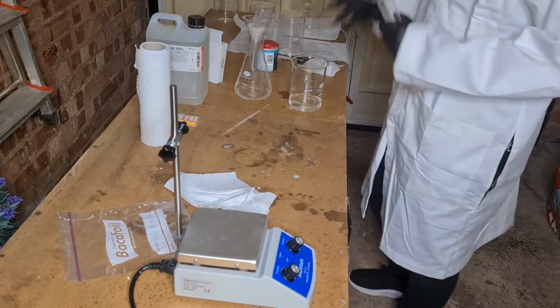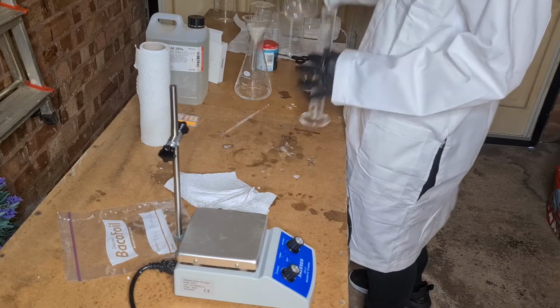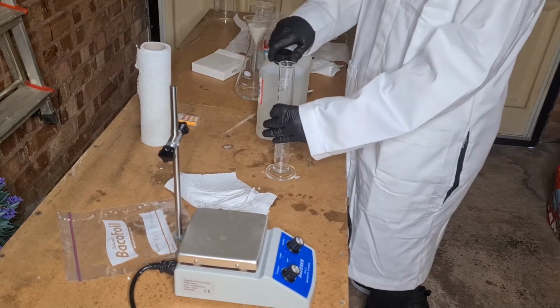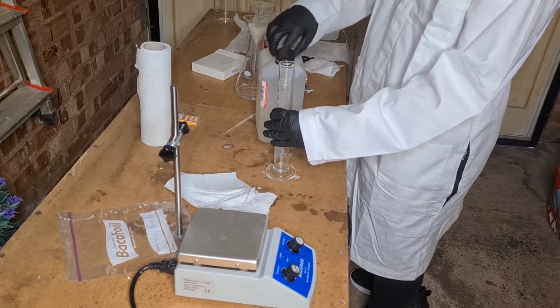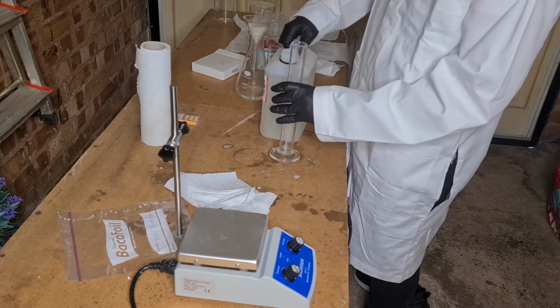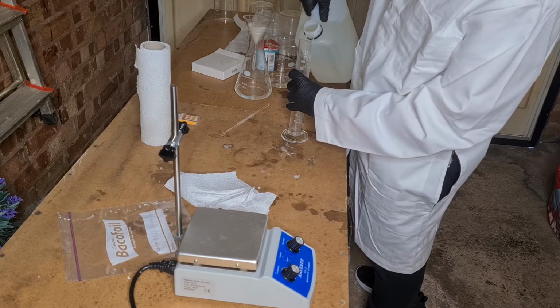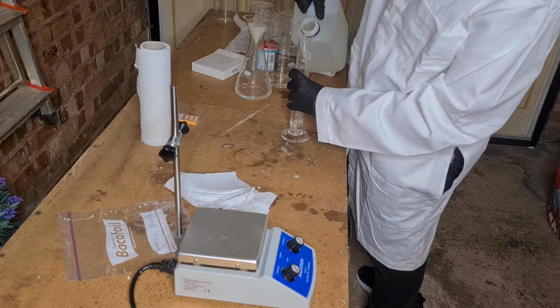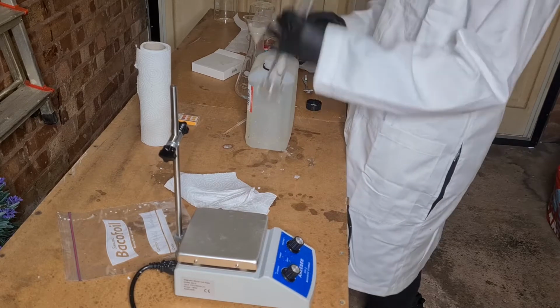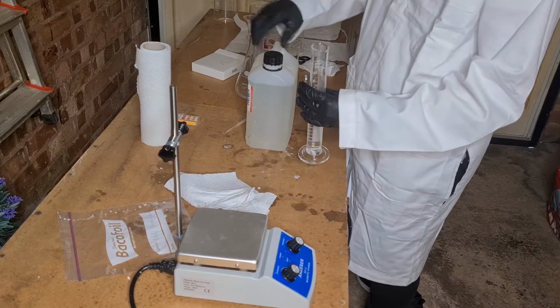So while we're waiting for all this to filter, we can put our hydrochloric acid into a measuring cylinder. So here's our acid. We're going to just undo that. You want to be very careful with this, mostly because it is hydrochloric acid and it is corrosive, like I previously mentioned. So I'm just going to pour that in carefully. Anything we don't use, we'll just pour straight back into the jug.